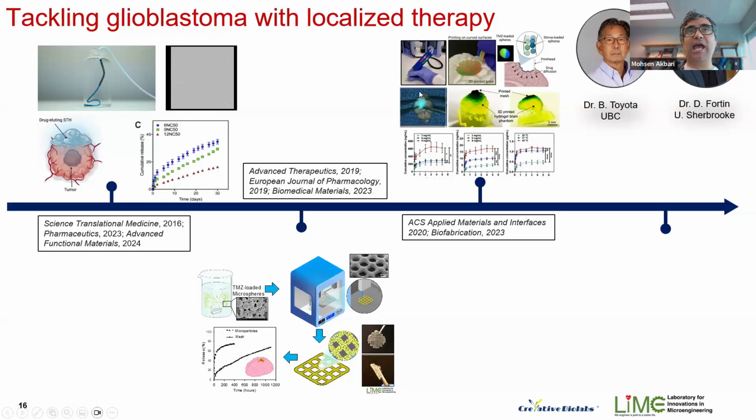we developed this handheld bioprinting device that directly prints therapeutic payloads into the site of the disease. This has a microfluidic print head that enables manipulating up to 4 different materials simultaneously and sequentially, which enables us to achieve highly sophisticated patterns within the tumor. And then the drugs, once they are delivered, diffuse out and reach the sites of the tumor where needed.